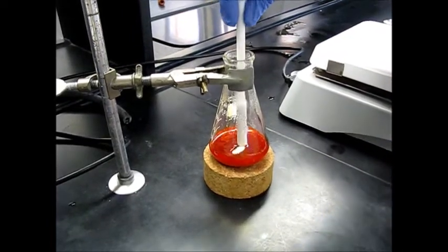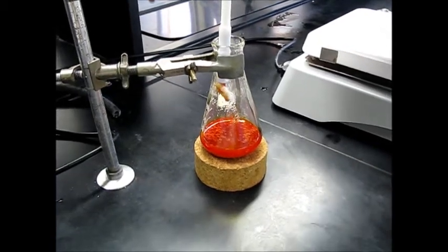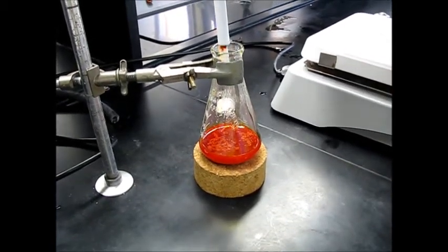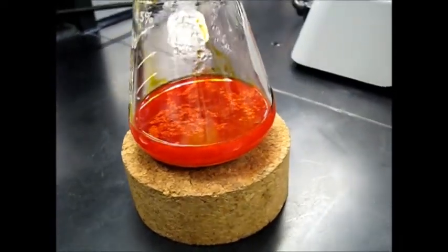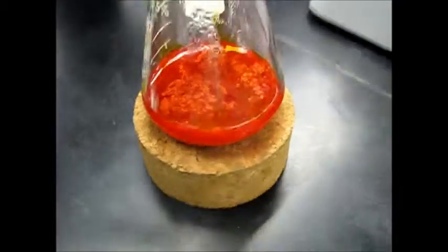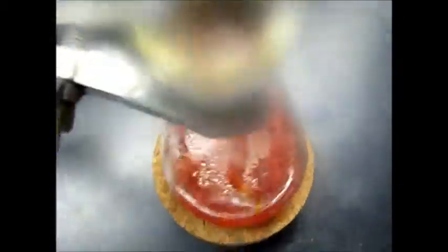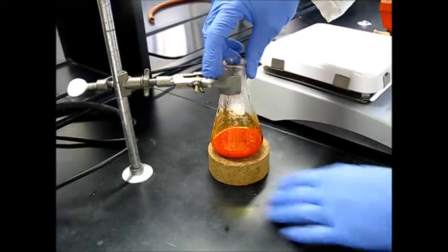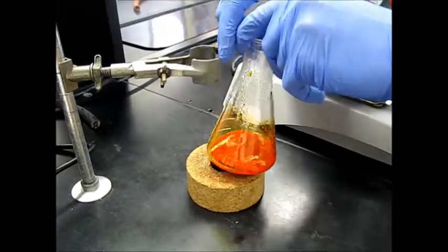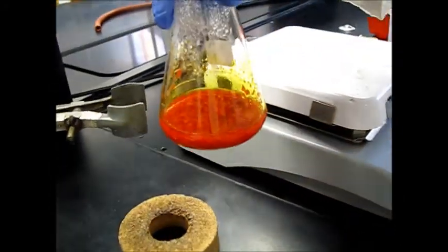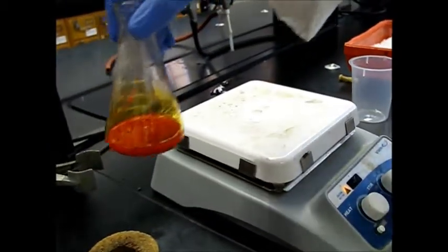So we lowered it down to the cork ring just so it wasn't hanging in the air. We're going to go ahead and take out our stir bar. There's not too much product on it, so we can go ahead and just set this off to the side. We'll let it cool down to room temperature and then put it in an ice bath. So we're going to go ahead and move it to the ice. You can see we're already getting solid crystals to precipitate. So we'll set it in the ice for about maybe 10 minutes and we should get quite a few crystals.